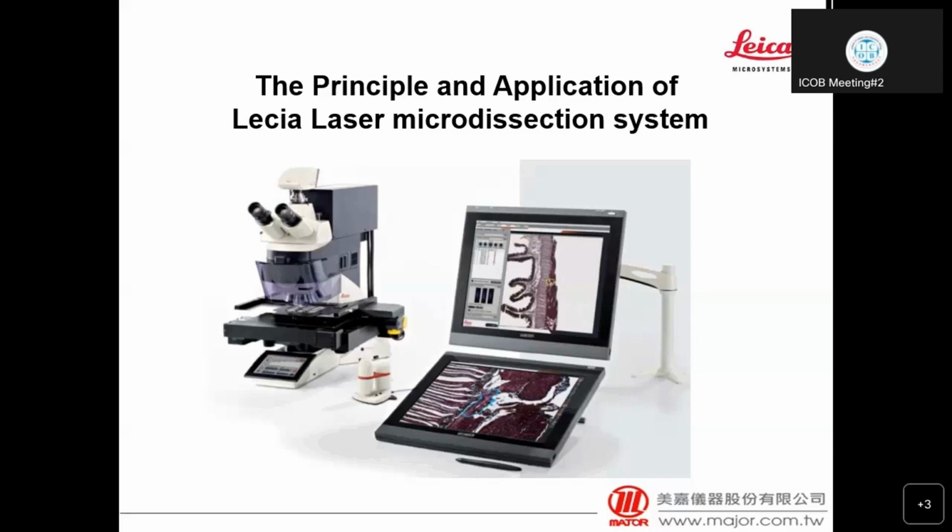In this section, we will talk about the principle and application of Leica laser microdissection system. So, what is LMD laser microdissection?